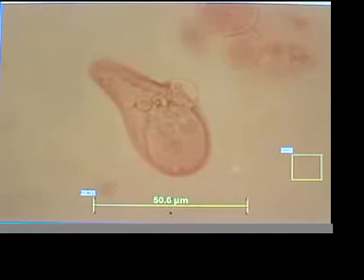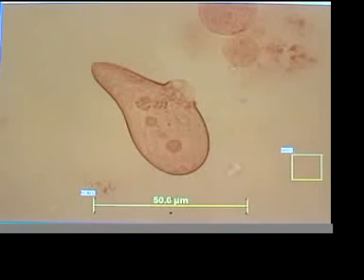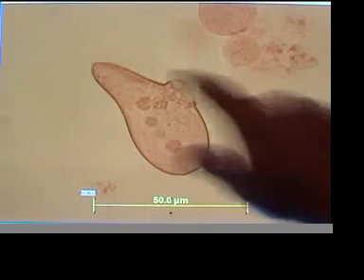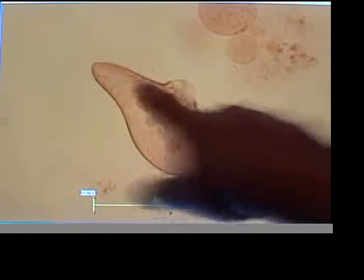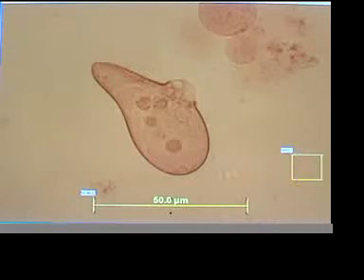I am assuming that the blister forming in there is part of him because he seems to be a break here, extending out, a bulging in the cell membrane area. But maybe he's actually on top of another organism who devitalized. But you can see the bend here would indicate that's part of him.